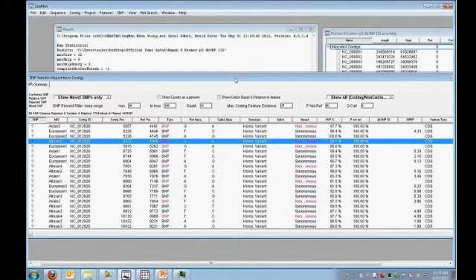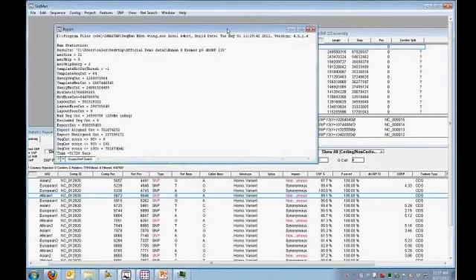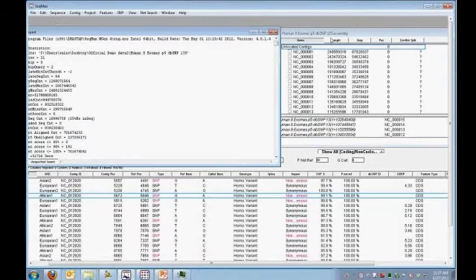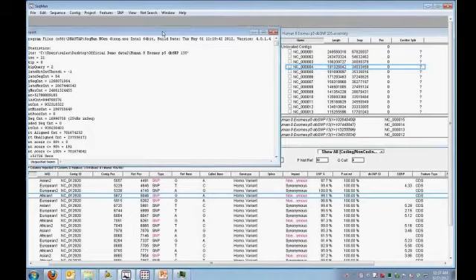And so here's a BAM file, this assembly file in SeqMan. The first window that you'll see, actually it will be these two windows. Here's a list of my chromosomes, chromosome 1, 2, 3, 4, and so forth. You can see the length, the number of reads out of a line. That's 67 million, 54 million. So this is a lot of data that we have showing here.